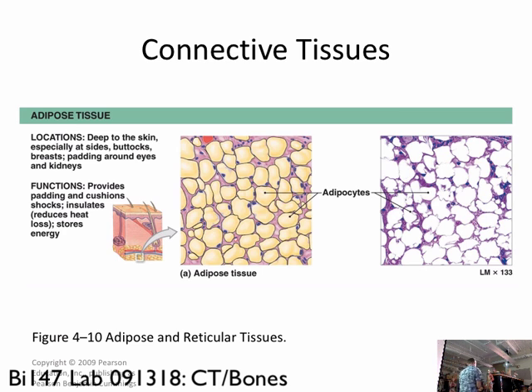Oh, yeah. Let's take the time now to actually go look at the adipose slide. Pardon me. Thank you for keeping me on track. Let me get out of the way. How's it going? Who needs help? Who wants moral support?